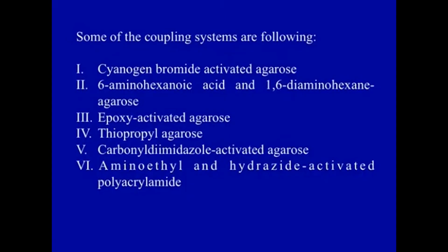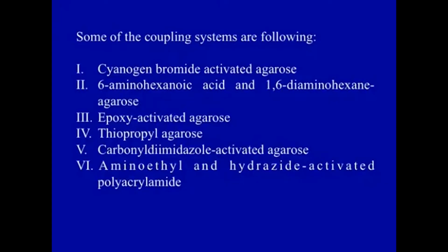Then there could be a lot of others, like epoxy activated agarose, which is agarose to which 1,4-bis-2,3-epoxypropoxy butane is coupled, which contains free oxirane groups. This group allows linkage of sugars, carbohydrates or any other ligand containing hydroxyl, amino or thiol groups. And then there could be thiopropyl agarose. There are other materials available here.